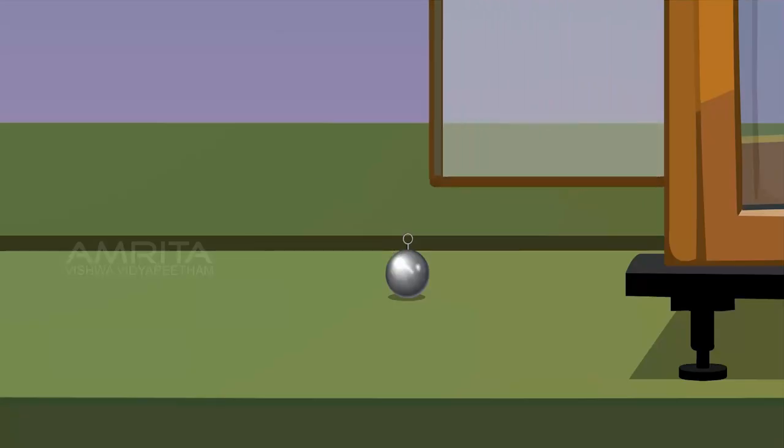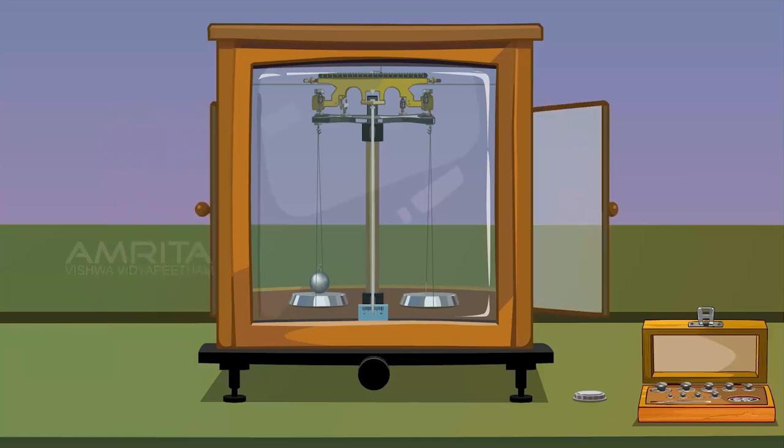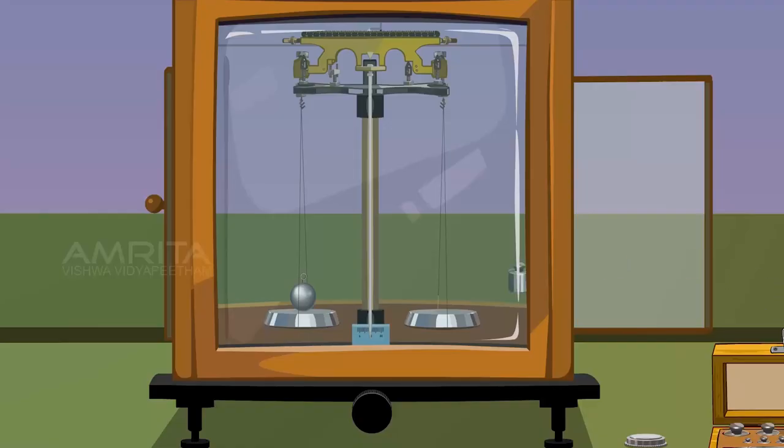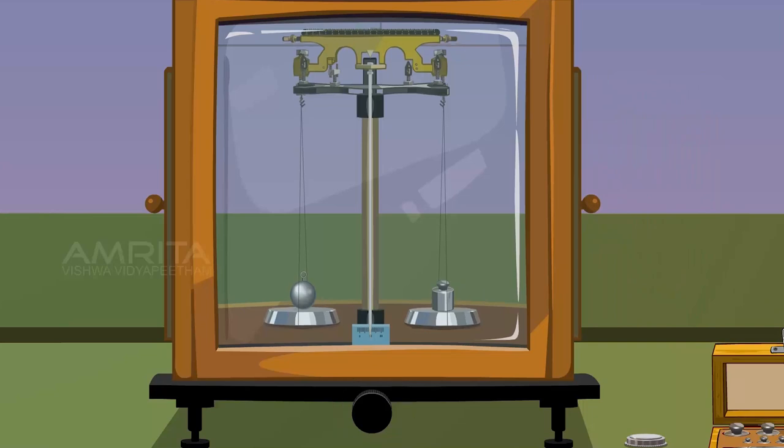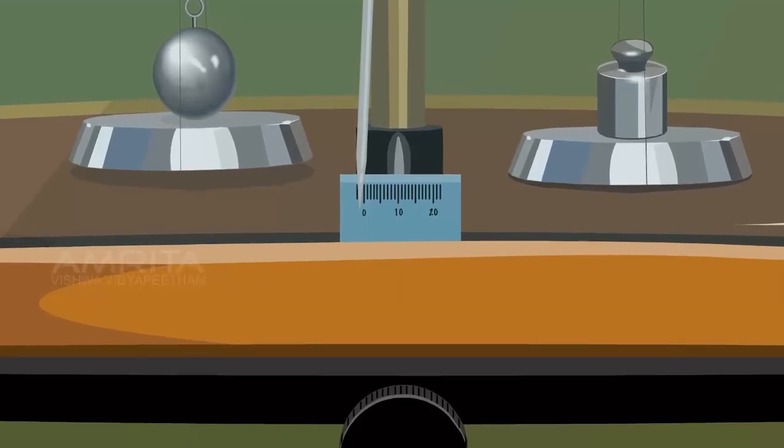Open the door and place the given bob in the left pan. A suitable weight of 20g is placed in the right pan. Then close the door and release the balance. Notice that the weight is more than the object.